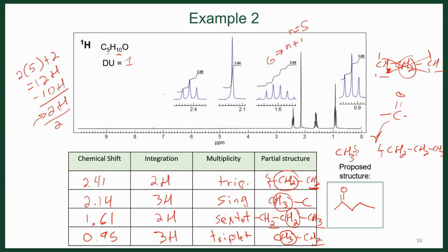So I know this video is a little bit longer, but hopefully this shows you how to think about a lot of this proton NMR data. There's a lot of data here, and the major exercise that you want to take away from this is how do I manage this data, keep it all straight, and be able to work with this NMR system to make partial structures, to think about molecules in a very logical and systematic way. And then it becomes more of a puzzle where you're being able to look at and determine an organic structure fairly quickly. All right, so good luck.